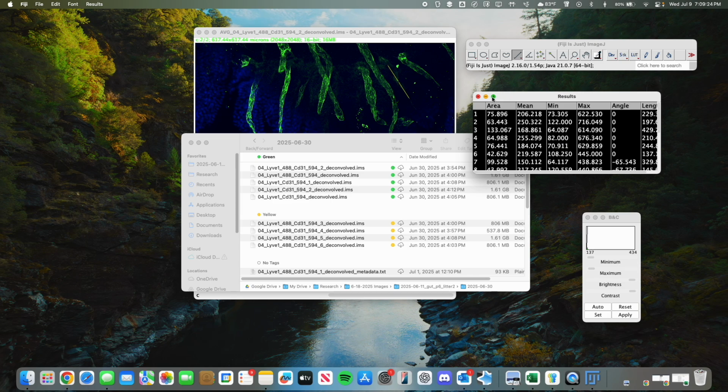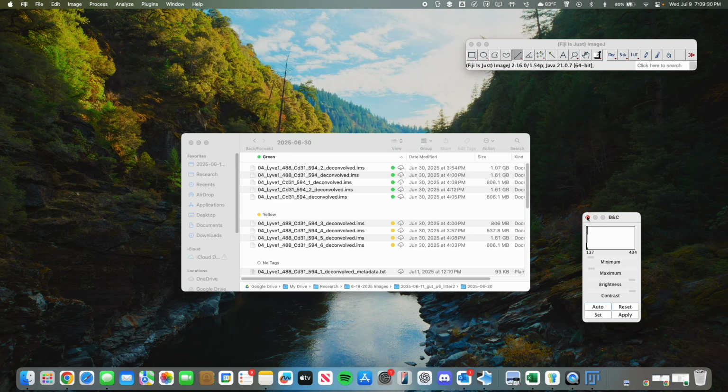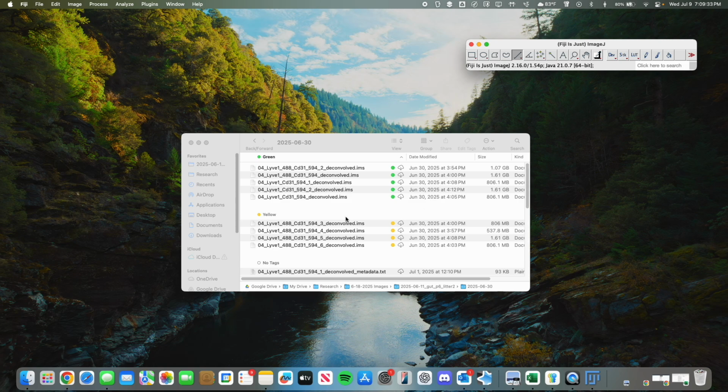And I'll go ahead and close this as we don't need those values anymore. We don't need to save them. Go ahead and close this other image, close this, and if I'm working on more, typically I'll just go ahead and drag the next one in, or I'll just open it and get back to it. But one more thing I wanted to talk about before the end is some of these shortcuts.